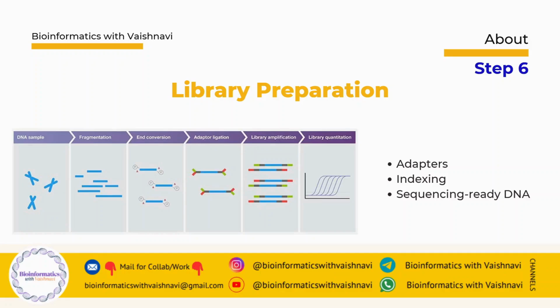Next is library preparation. It is a very important step in NGS. In this step, DNA fragments are prepared, adapters are added, and samples are indexed. This process converts DNA into a sequencing-ready library. Poor library prep can result in failed sequencing, even if earlier steps were done correctly.